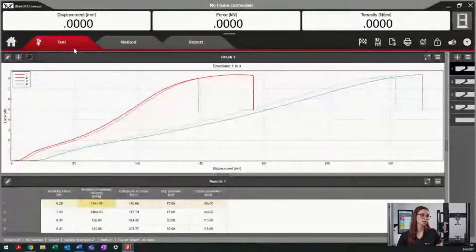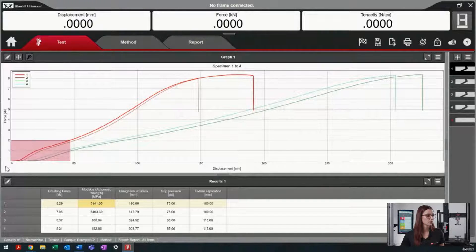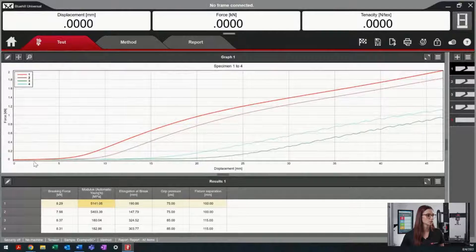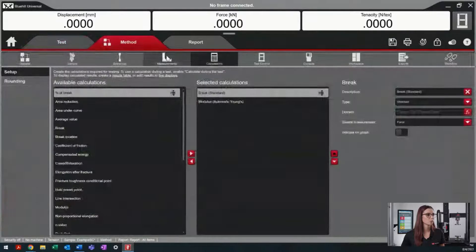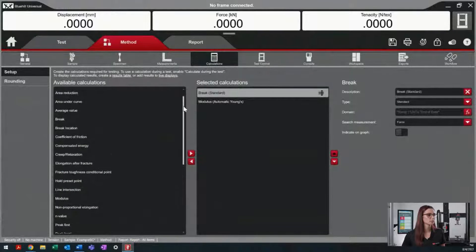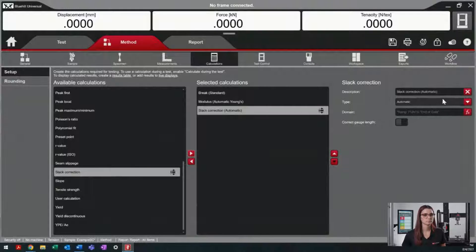Now let's jump back into Blue Hill Universal. Here we see four different specimens that have not had a preload. As you can see at the beginning of the graph, there is a section in which the force does not increase. This is a perfect time to use the slack correction calculation. By doing this, we go into our method tab under calculations. As you can see, there are four different types of calculations in our slack correction.